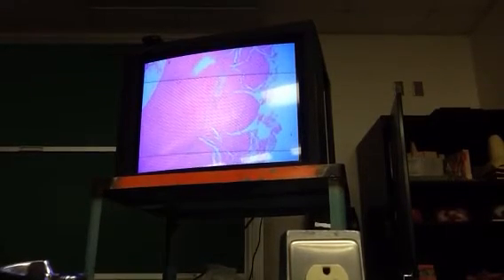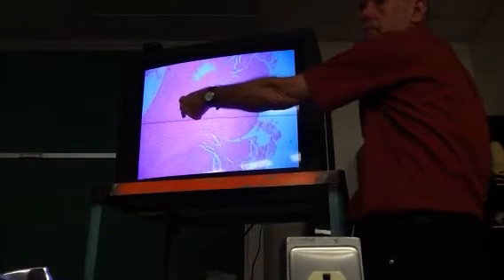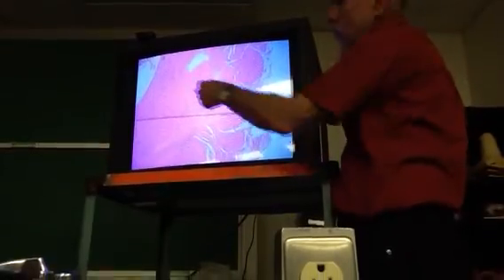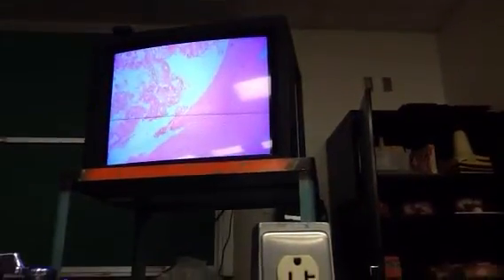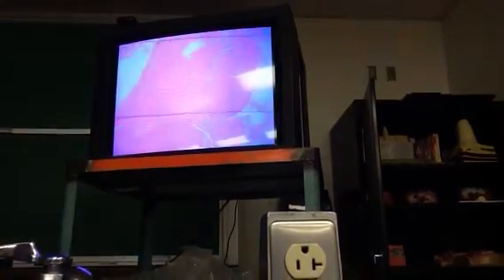Right here, all of this is muscularis. Which layer is longitudinal, which is circular? It looks backwards. Circular is your innermost, it's going to be adjacent to the submucosa. It looks like it should be different, but that's again because we have a cross-section view.